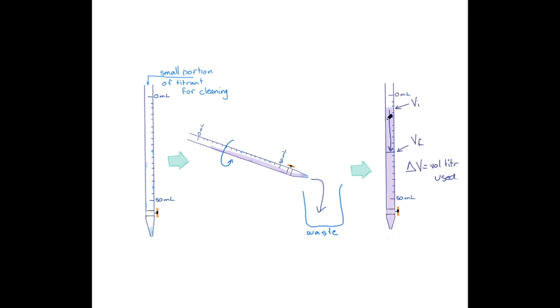So you don't need to spend a lot of time getting your titrant exactly onto the 0 mark. Just fill it up wherever. Just make sure you have enough titrant to complete the titration without going below the 50 milliliter mark.